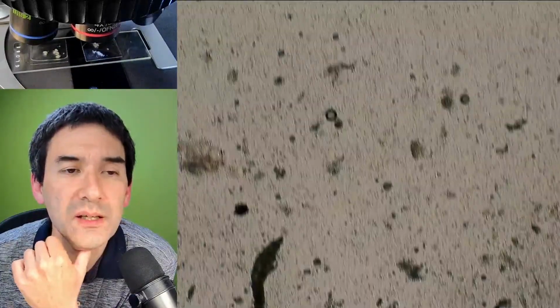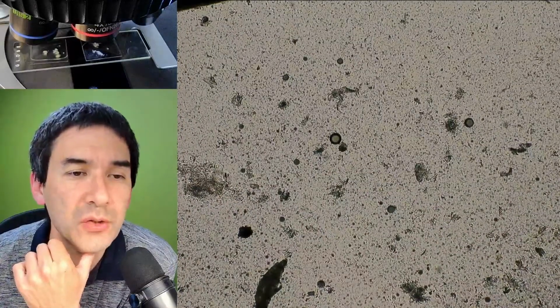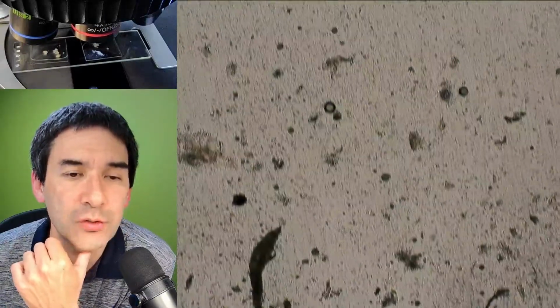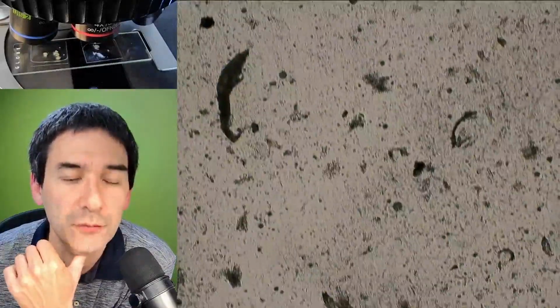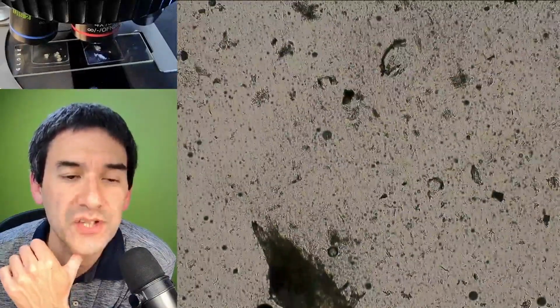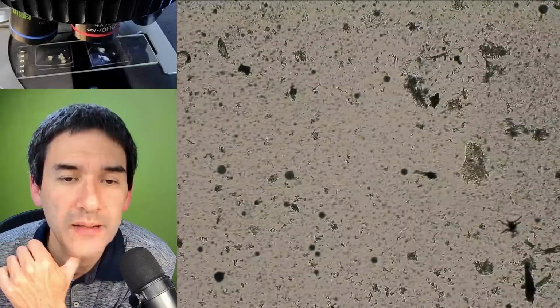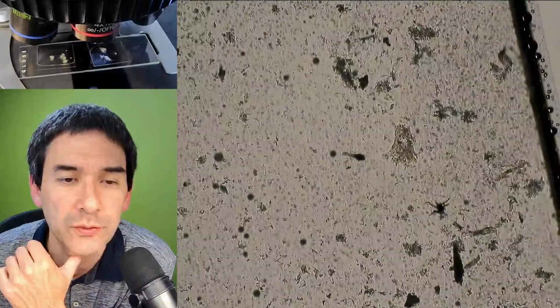Sometimes those droplets that you see are not necessarily, this one is an air bubble, but I've also seen some fat droplets in fresh ones, because this one has been in alcohol. All of the fat droplets, the fat has been dissolved, of course.